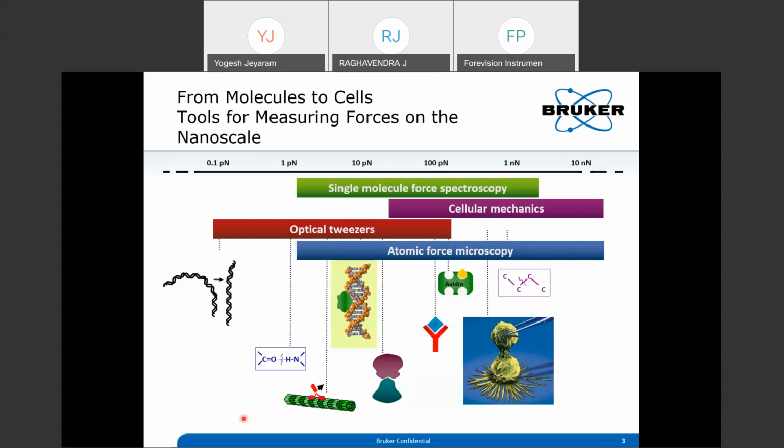And that's where it becomes its own, right? When you are studying very, very small force interactions, the optical tweezer has the resolution in terms of force to help you study that without concern for noise or artifacts that are introduced by the instrumentation technique itself. And that's why people use that on top of the AFMs as well. AFM is still widely used for single molecules and cell studies. The optical tweezers add a dimension to that.